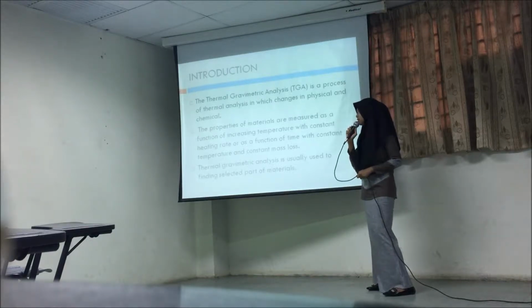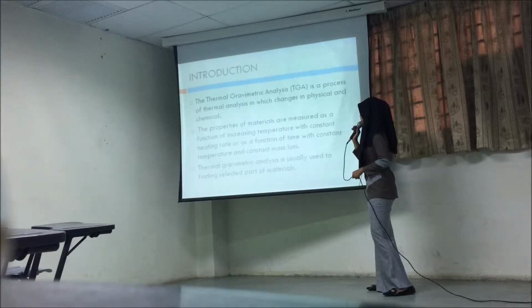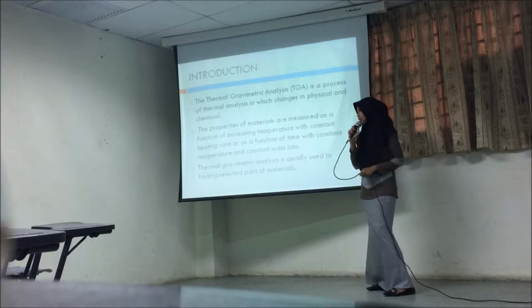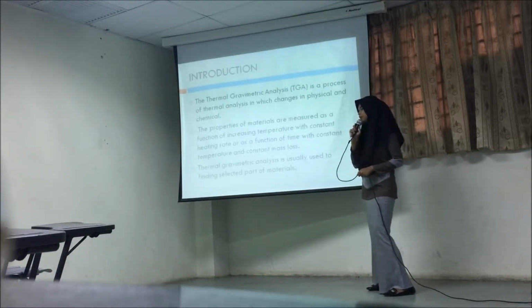Lastly, thermal-gravimetric analysis is usually used to find selected parts of a material. That's all for my part.